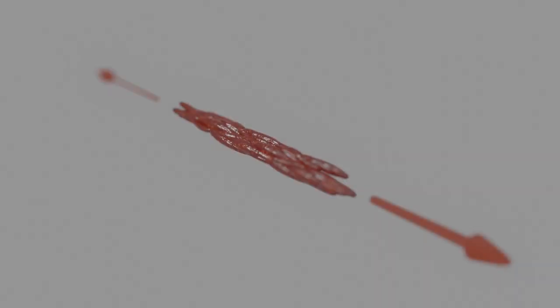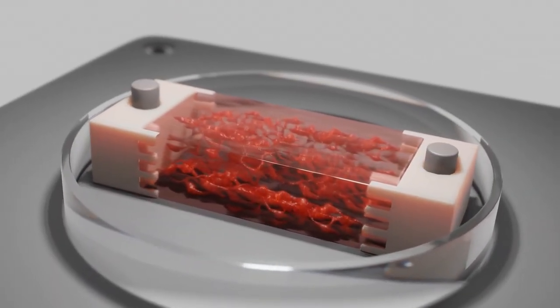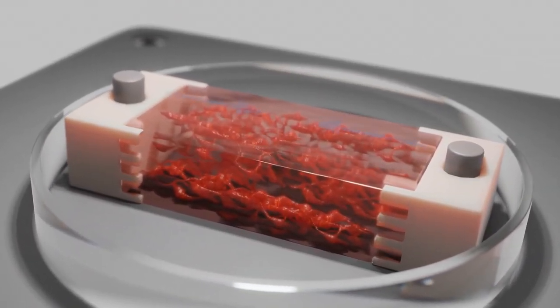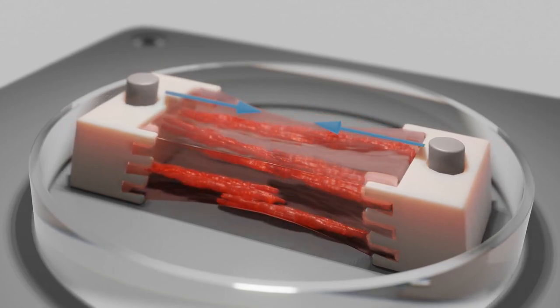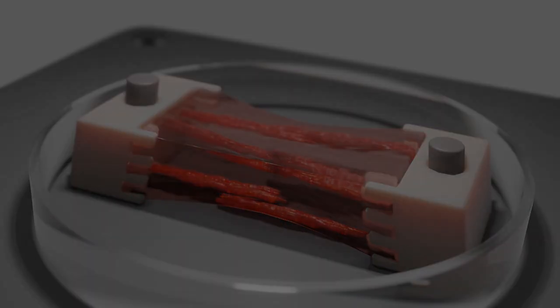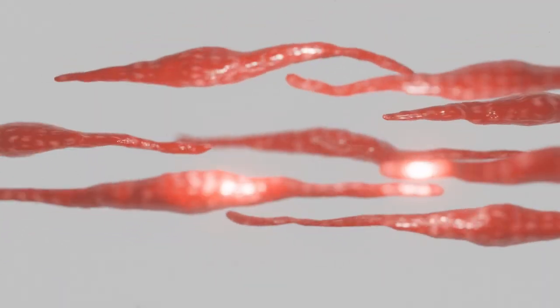Mechanical stimulation can induce myogenic differentiation and uniaxial myofiber formation. Passive mechanical tension can be applied to the forming tissue by introducing two anchor structures at the extremities of a muscle block. Such a constraint converts the internal forces driven by hydrogel shrinkage and tissue maturation into passive tension.